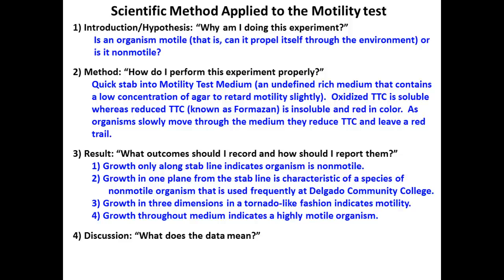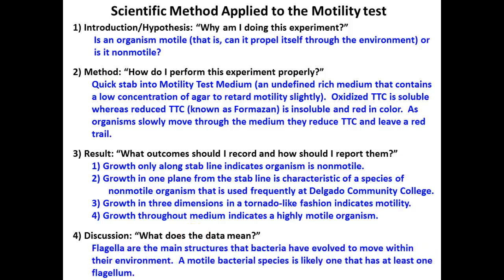If it is motile, we should see growth throughout, right? Or we might even see that little tornado effect. But again, if you turn your tube 360 degrees, you should see uniform growth out from your stab line, right? That would indicate a positive result, right, for an organism being motile.